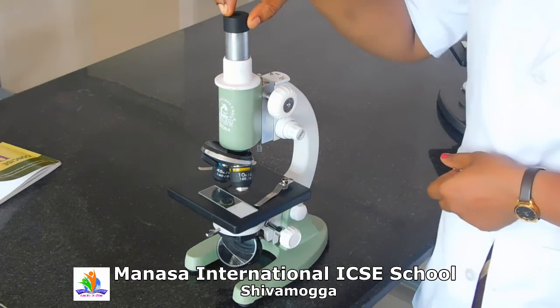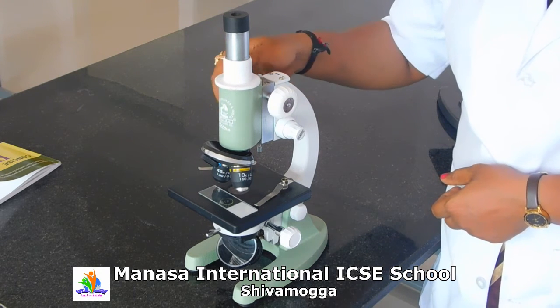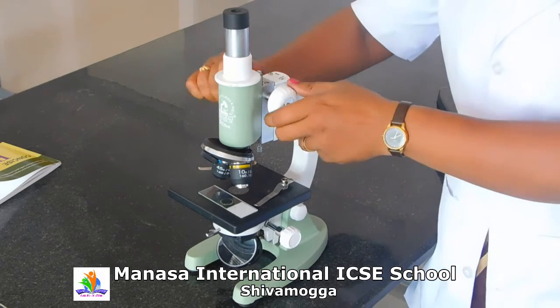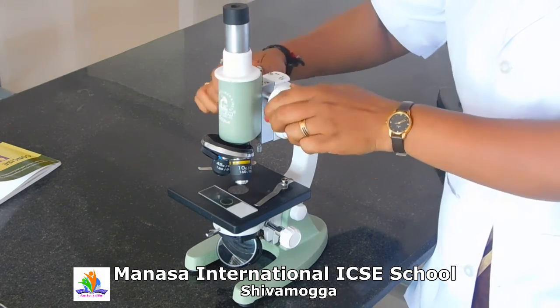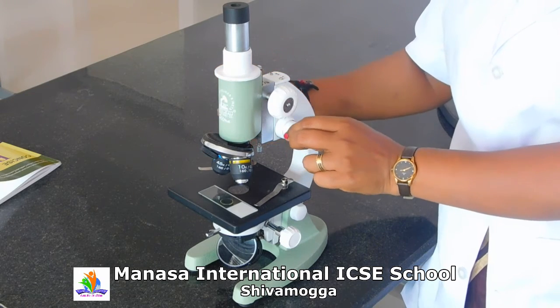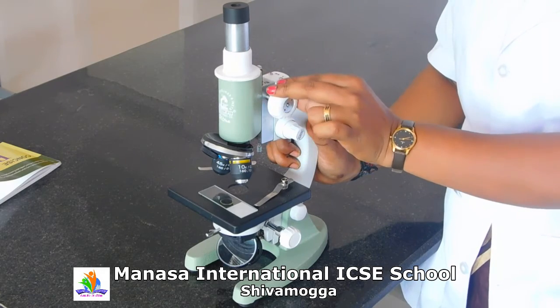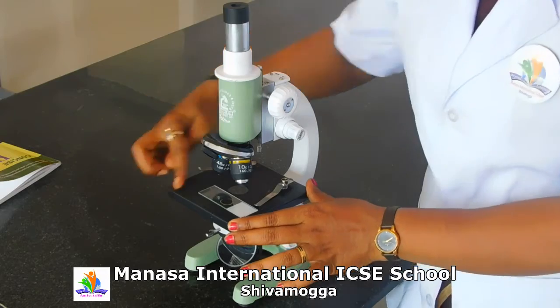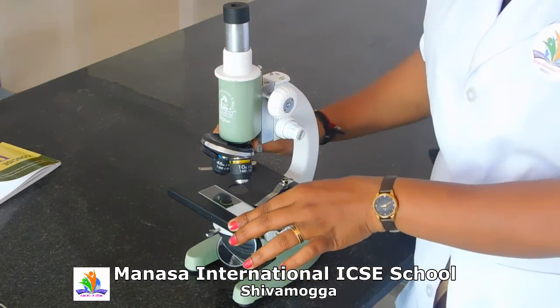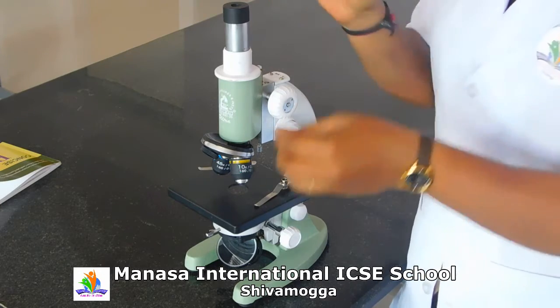This is the eyepiece, and this is the coarse adjustment, which is large. We can move it up and down, okay, and this is the fine adjustment, which is the smaller one. The larger one is the coarse adjustment, okay, and this is the slide table, okay, this is the slide, clear.